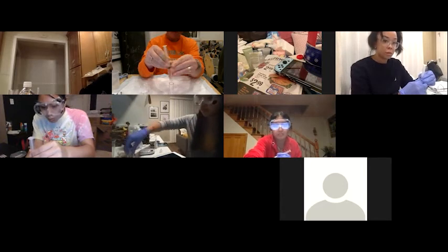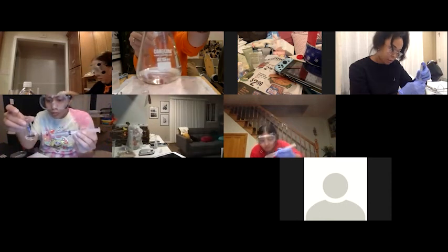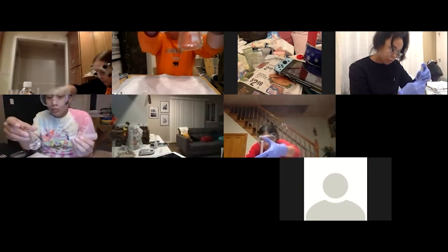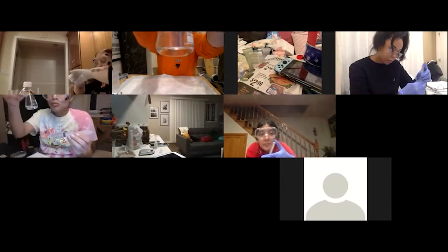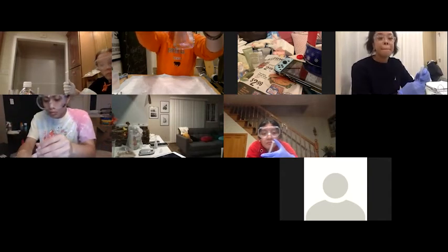And what you should see is, I don't know if you can see that, but it turns pink as I'm adding it. Here, I'll put it up and you'll see the same thing. When you add it, it turns pink. See that? But then when you swirl it, it goes clear again.